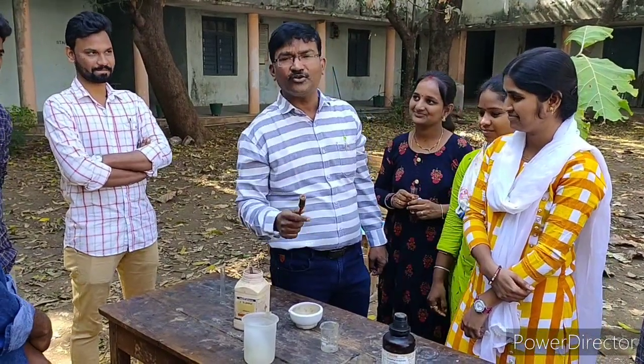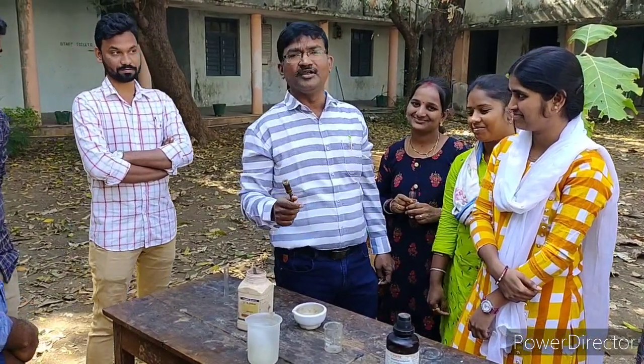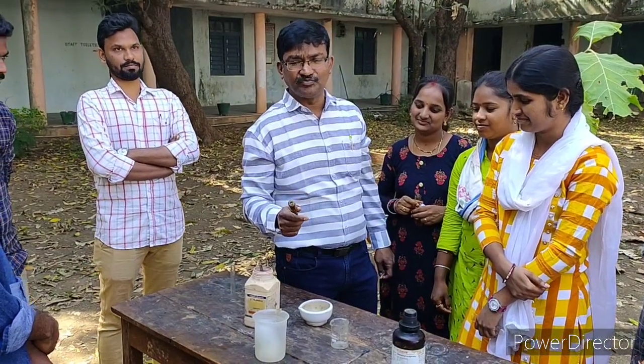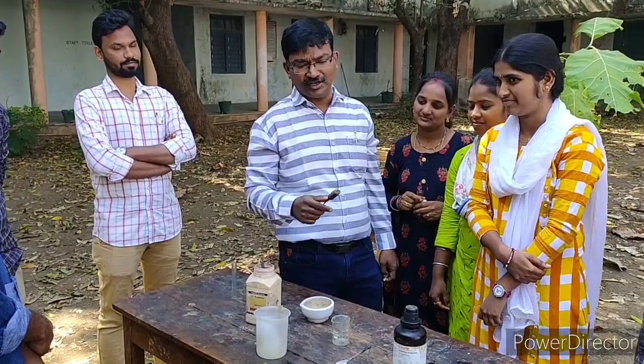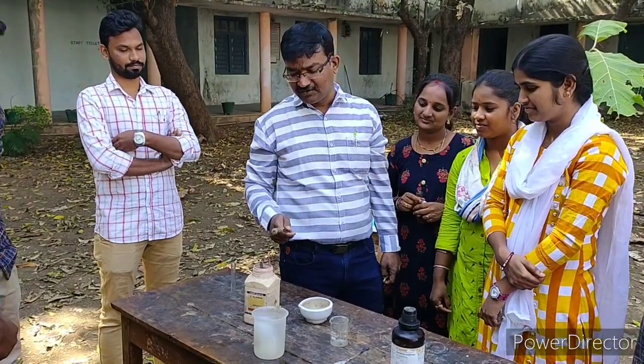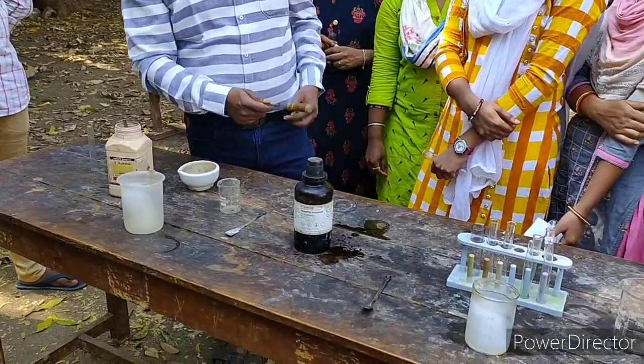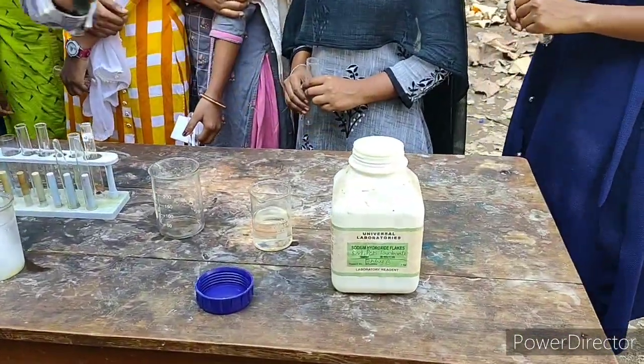In this video we are going to learn how to prepare Nerolin. Nerolin is the commercial name of beta-naphthyl methyl ether. For this purpose we require three substances: the first one is beta-naphthol, the second one is dimethyl sulfate, and the third one is NaOH solution.